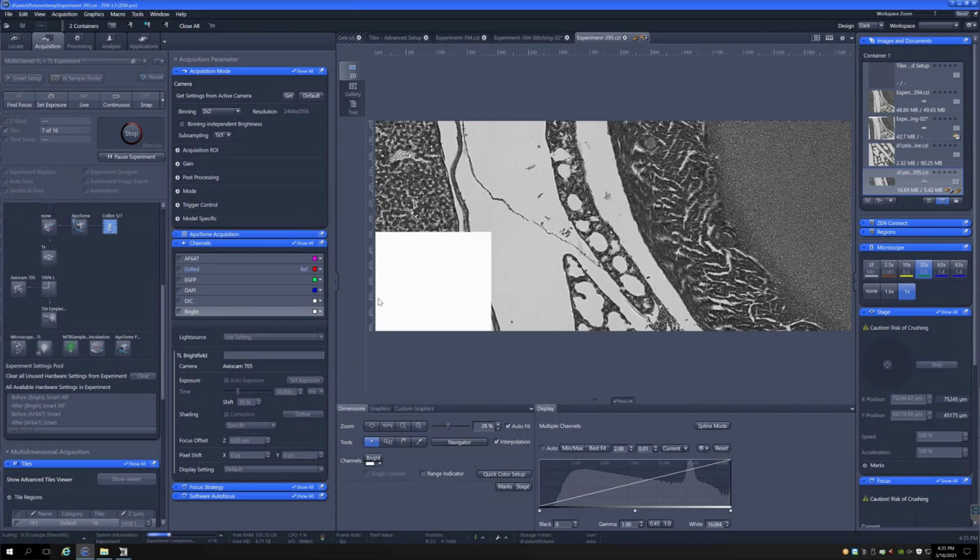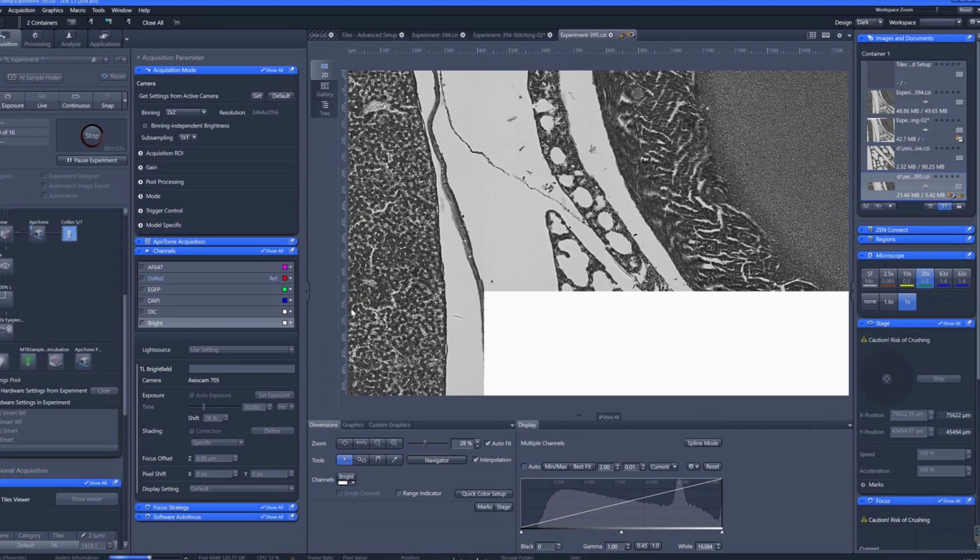Be aware that tightening the C-mount fastening ring may introduce further rotation of the camera. Make sure you pre-compensate for this slight rotation before you tighten it. Acquire one last tile region to verify that all the adjustments are correct.